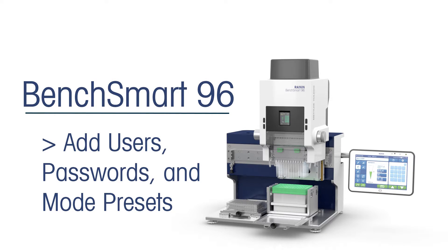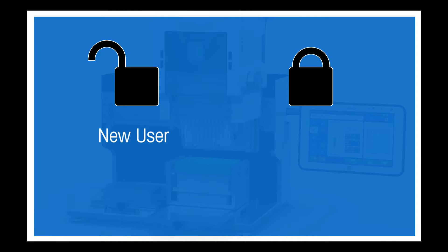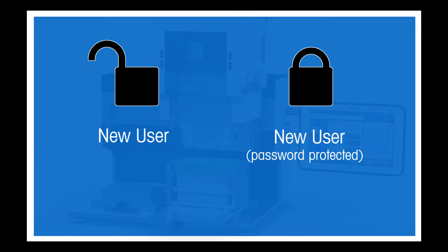Adding Users, Passwords, and Mode Presets. Add new users to BenchSmart and optionally protect their login with a password. You can also protect admin, the default user, with a password. Name and save experimental protocols, or mode presets, so you can retrieve those settings instantly.